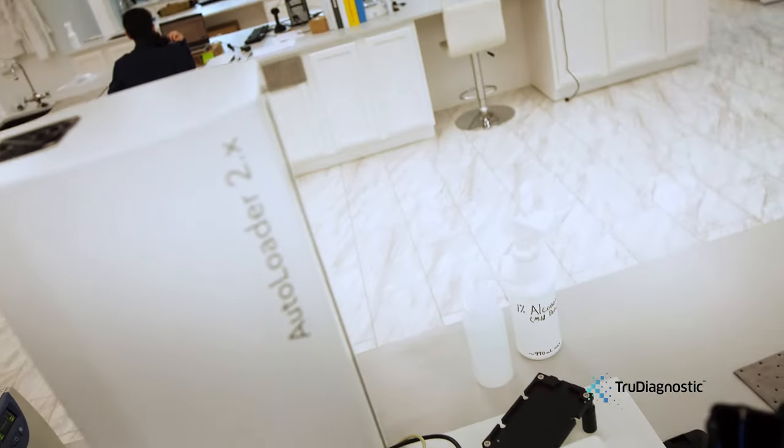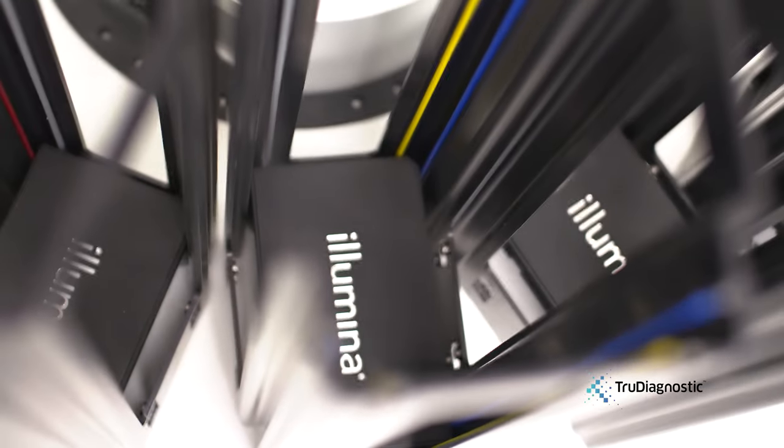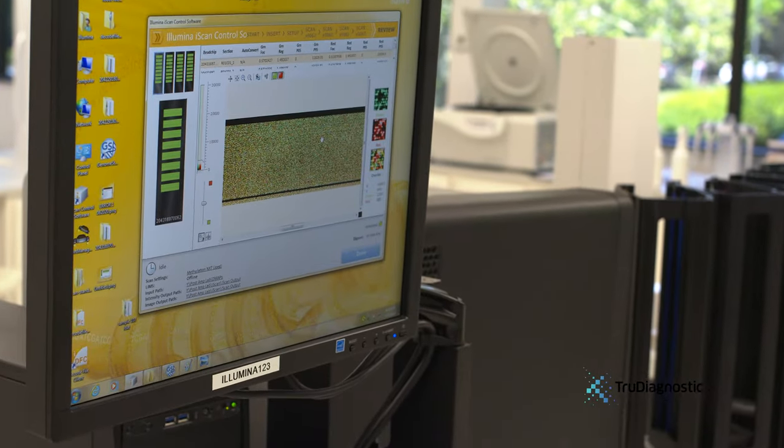This is the auto-loader, and what this allows us to do is automate the actual scanning process as well. If you were to do it manually, you would have to manually put four bead chips into the machine and work with the computer program.